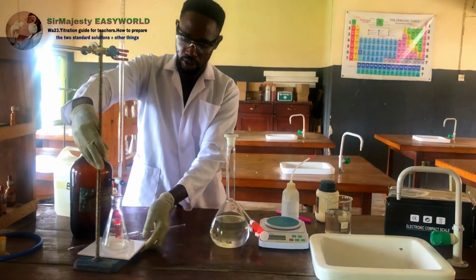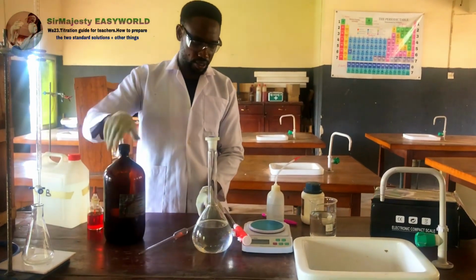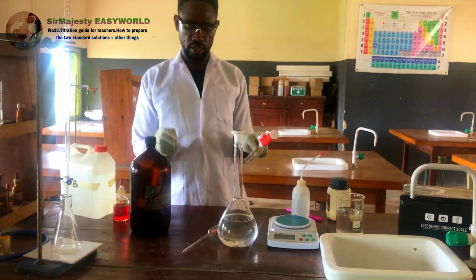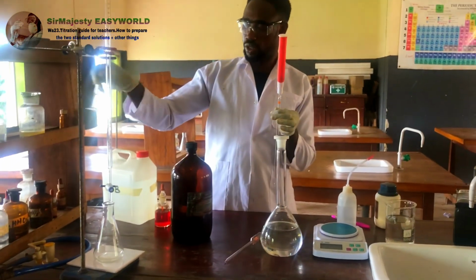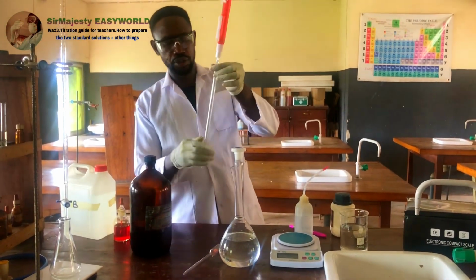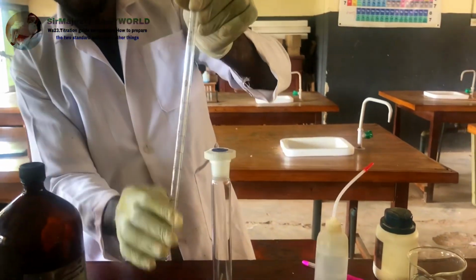So I'm shifting this for us to prepare that. Now, this is the raw acid. Simple. I don't even need to bring out a small container. Normally, if I don't have all this, I will pour some, then use this one and measure, which is more tedious. But hence I have this. This is a 10 ml graduated pipette. So the maximum you can measure is 10 ml.